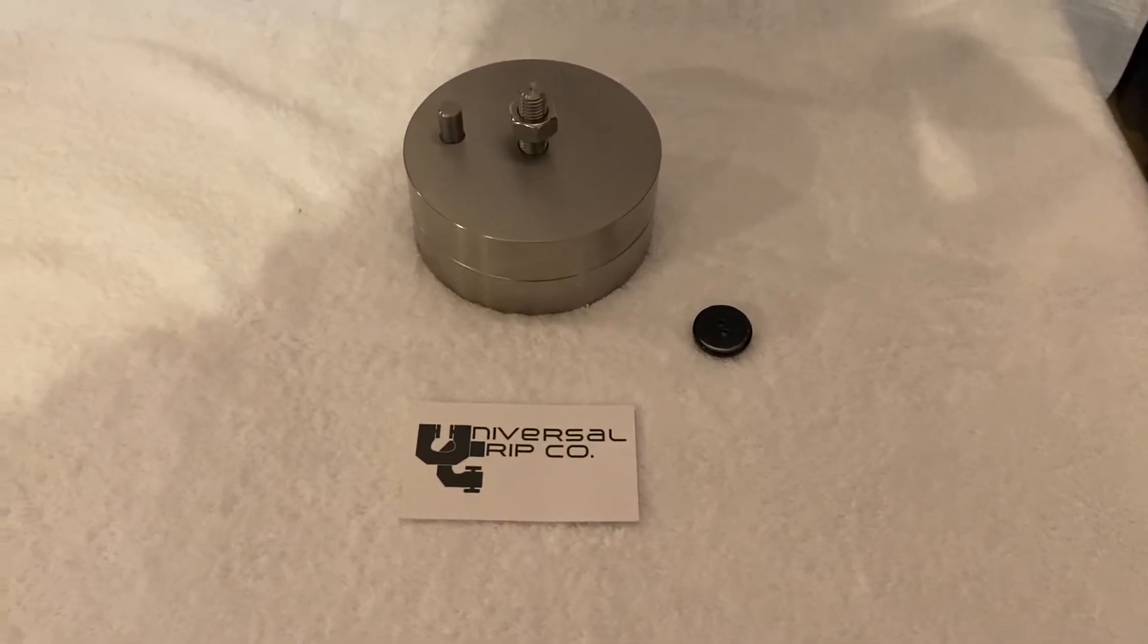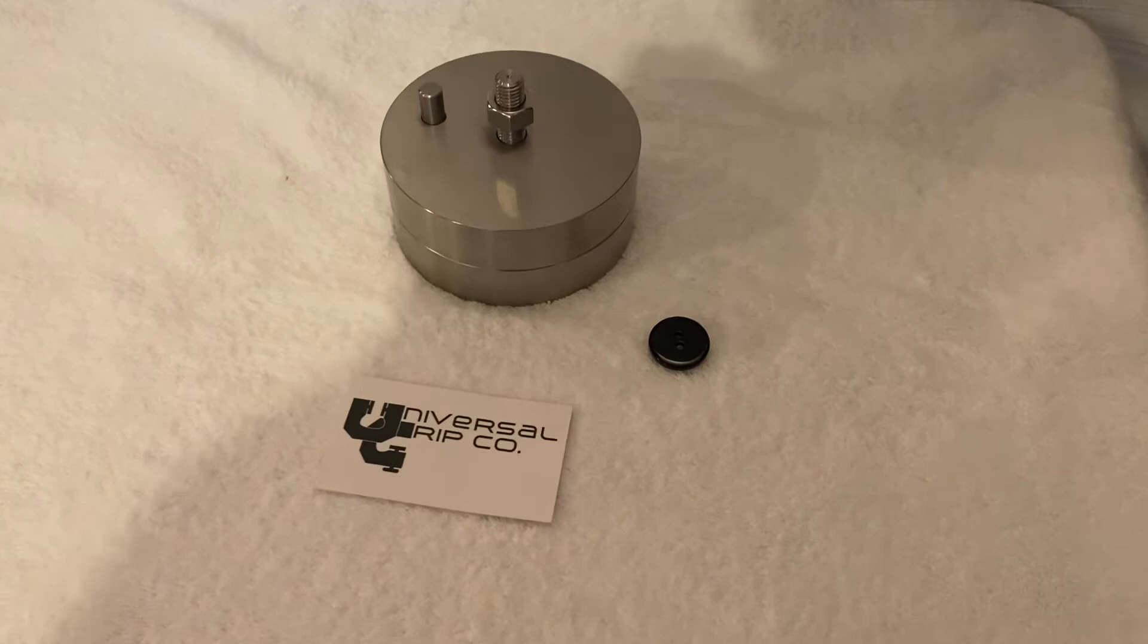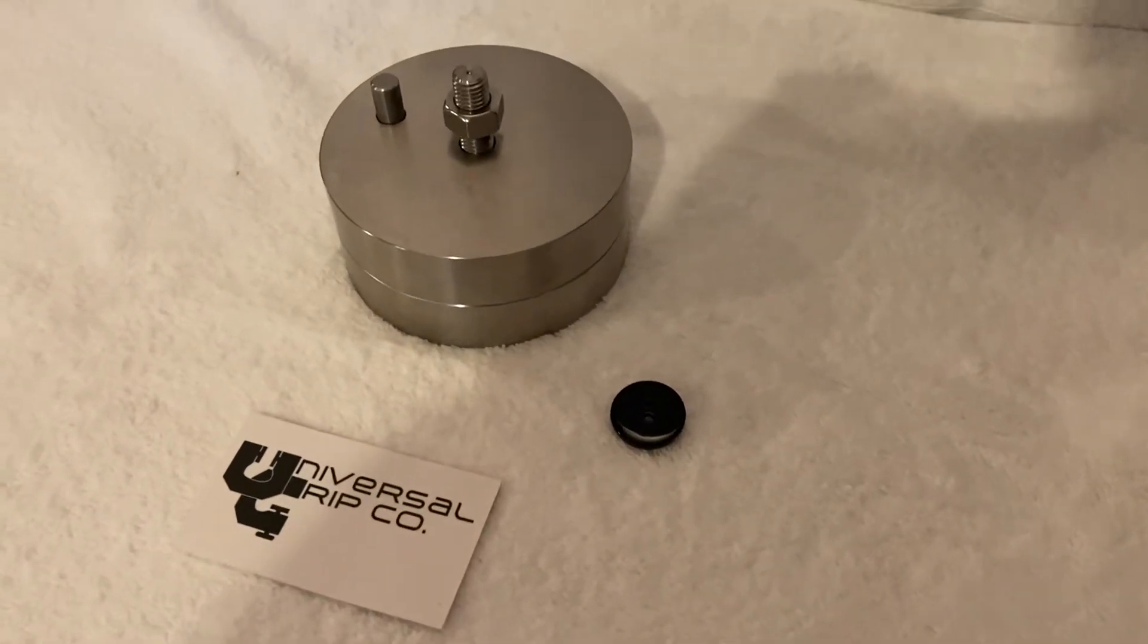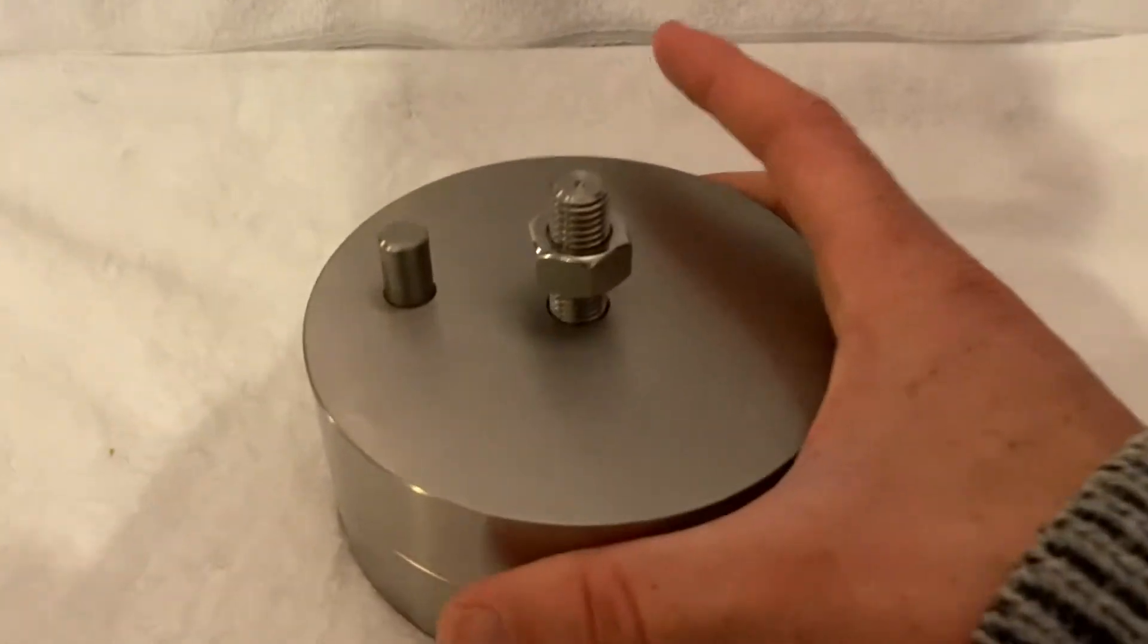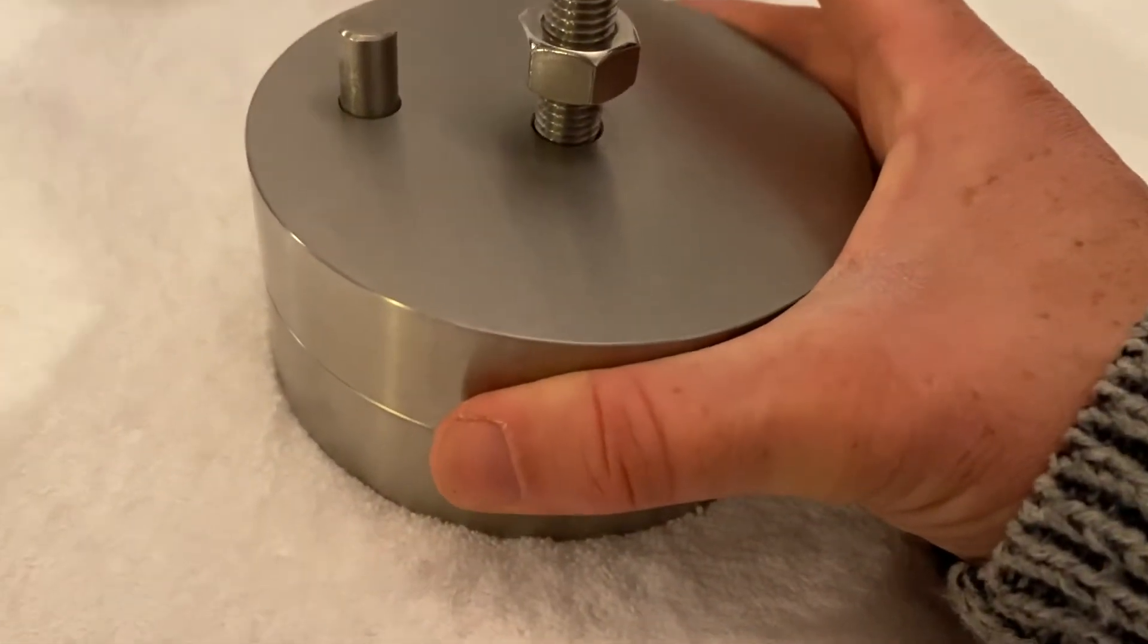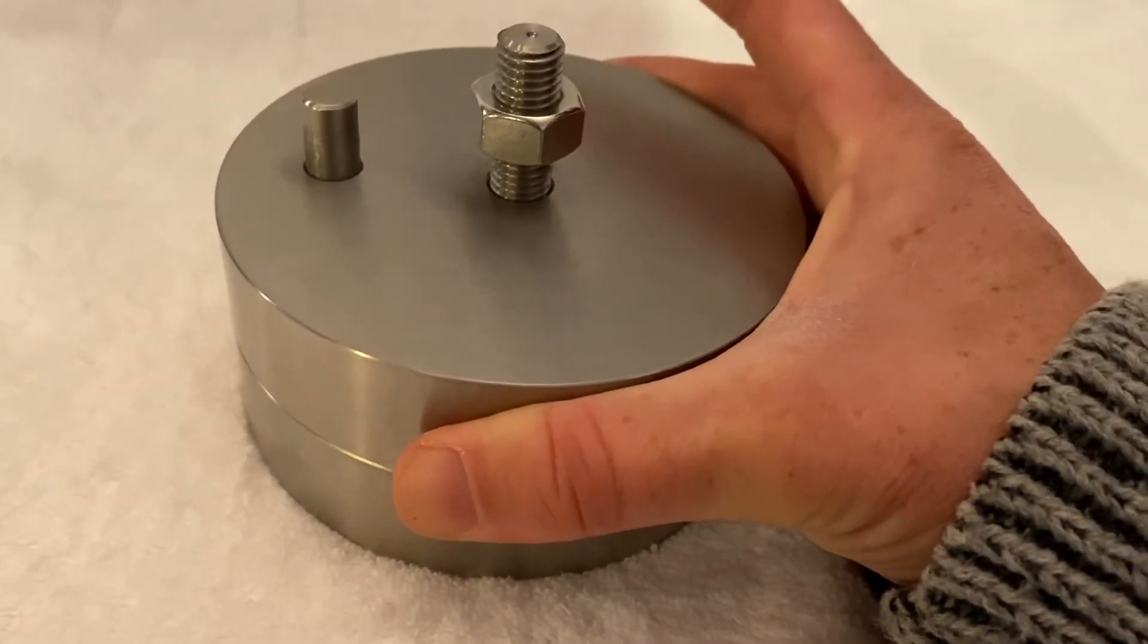Hello everyone, today we are showing the ASTM D395 method C fixture. This is a new method which was actually developed and released in 2018, and it's the C type fixture.